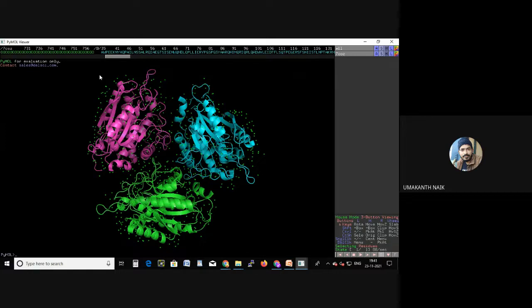Before, we were having some difficulty in removing the chain. Selecting everything, going from the starting chain to the ending termination, this made us feel difficult. So I'm just selecting here, just give a left click and select everything. If you select, the entire protein will be selected. Are you getting what I'm saying?